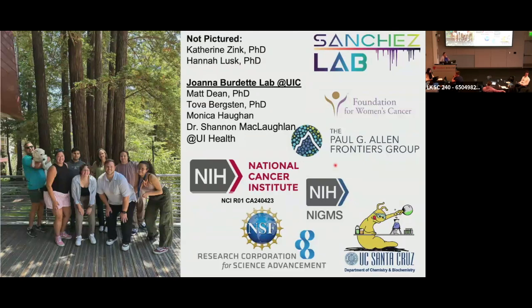Yeah. And maybe just one quick question. You as a chemist using the mass spec imaging, it's known that for many of the lipids, you have sweet spots in terms of ionization that you really detect. But for the small molecule things, like the really small things that you look at, are there certain metabolite groups where you say, when you look at the data, they always come up? They're like low-hanging fruits for small mass spatial metabolomics versus some stuff that's really hard to see?